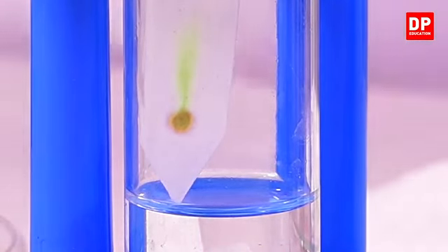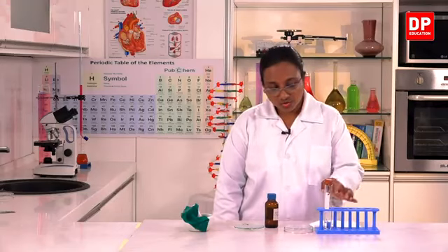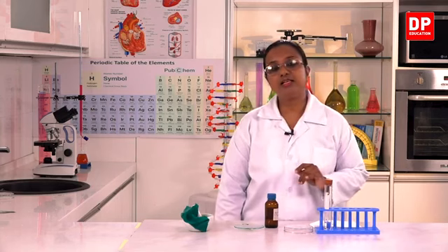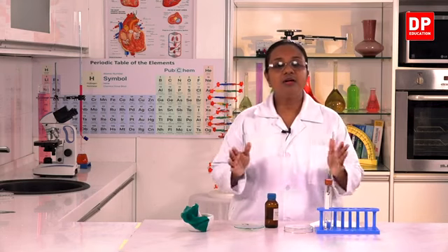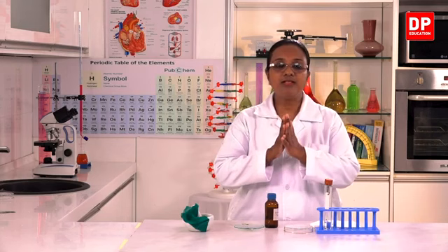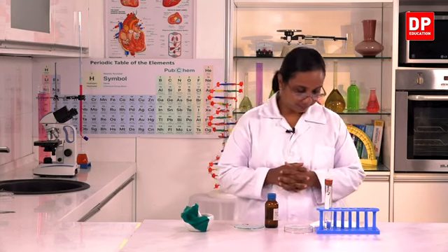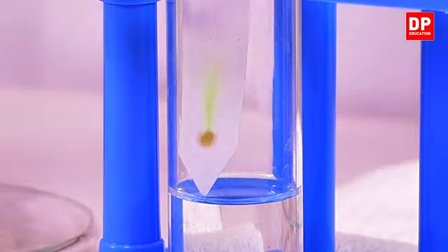And as you know, acetone is a volatile liquid. So it also vaporizes and saturates the container, that is the boiling tube here, so that the solvent, when it is moving upwards, doesn't spread throughout the paper. Again, you can observe the movement of the colored pigments. There, the different components get separated along the way.